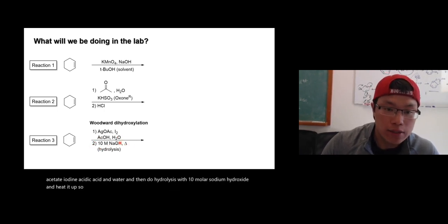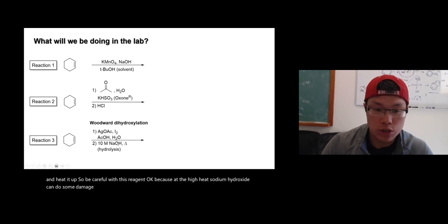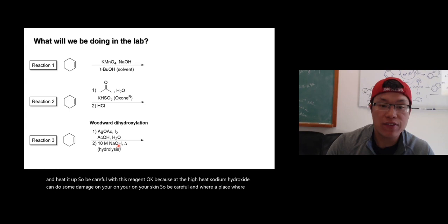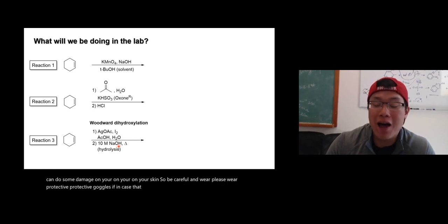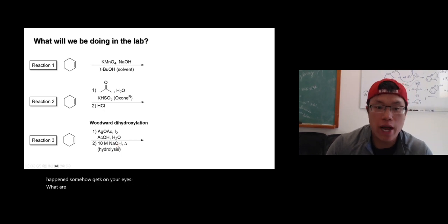So be careful with this reagent, okay? Because at high heat, sodium hydroxide can do some damage on your skin. So be careful and please wear protective goggles, in case the sodium hydroxide somehow gets in your eyes. The goggles will protect you.